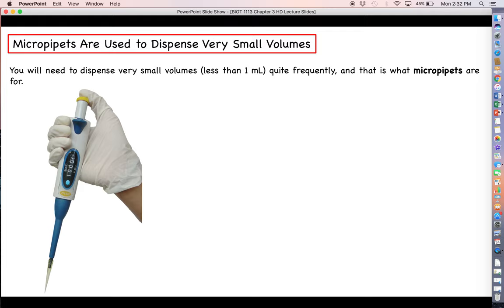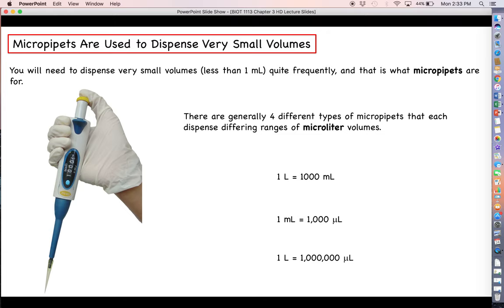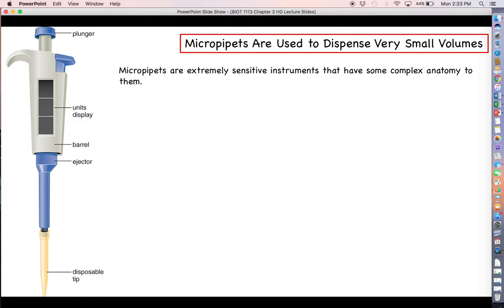Micropipettes are used to dispense extremely small volumes — anything less than one milliliter. You'll be working with these very frequently, so it's best to get acquainted with them now. There are generally three or four different types of micropipettes, each dispensing differing ranges of microliter volumes. Micro means 10 to the minus six, so one milliliter equals 1,000 microliters, and one liter equals one million microliters — giving you perspective on just how small a microliter really is.